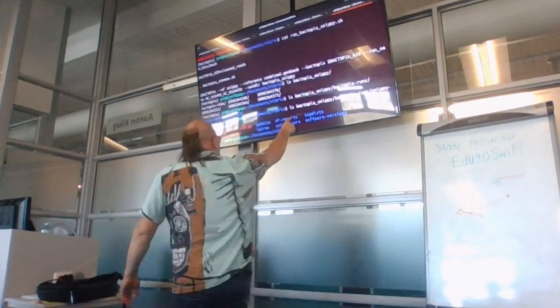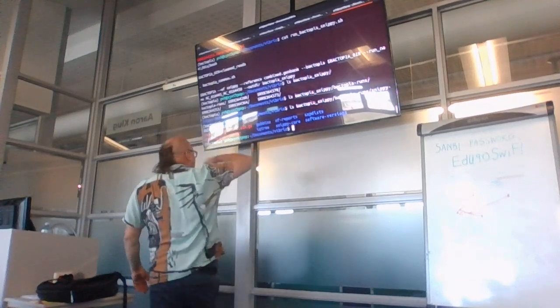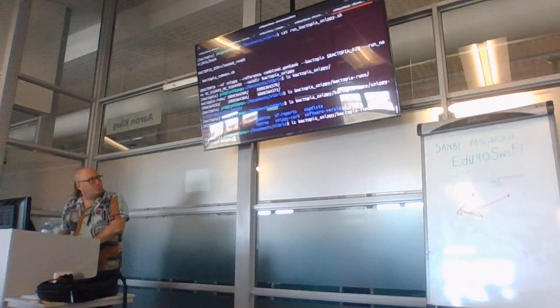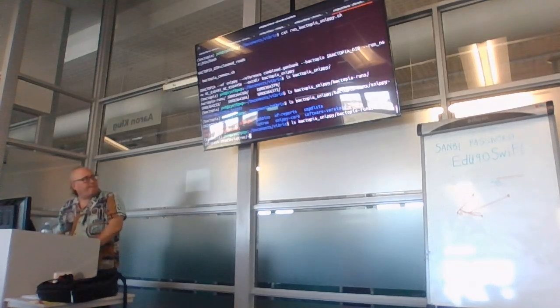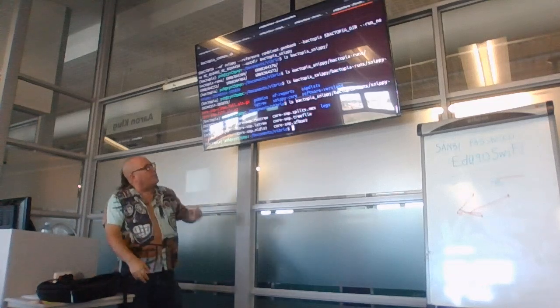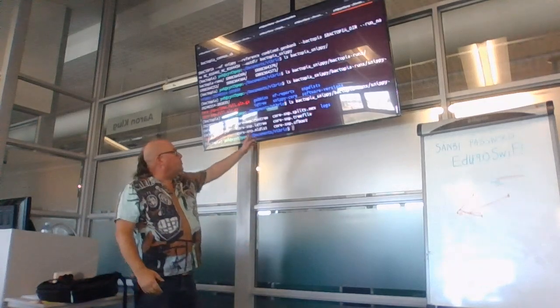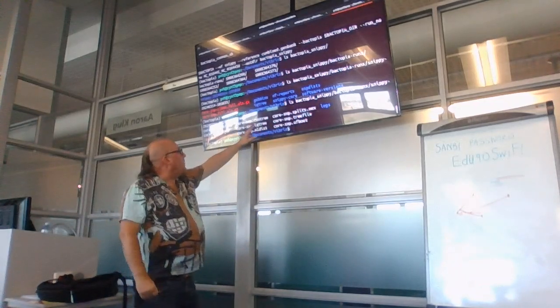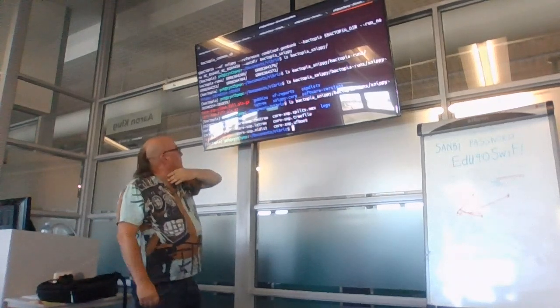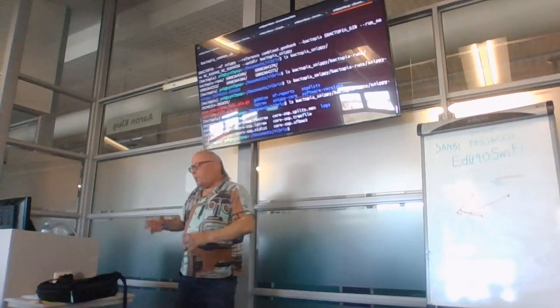And so in IQ-TREE, we have a tree file, an IQ-TREE file, and all of these things which are generated from the core phylogeny, okay?